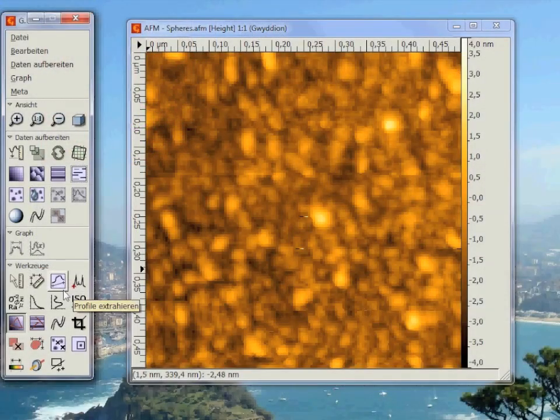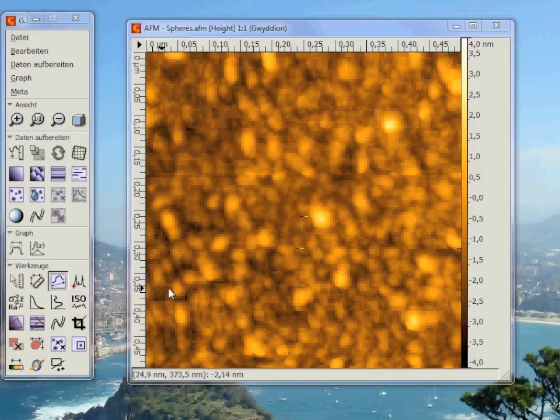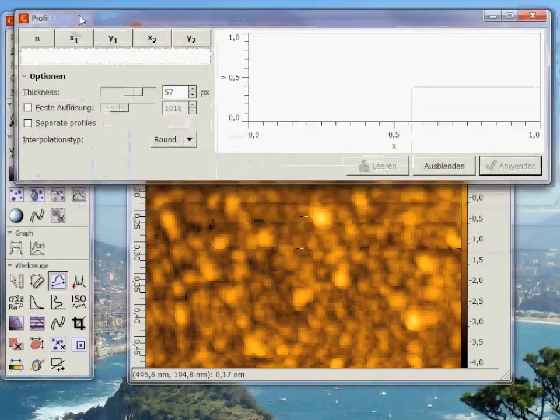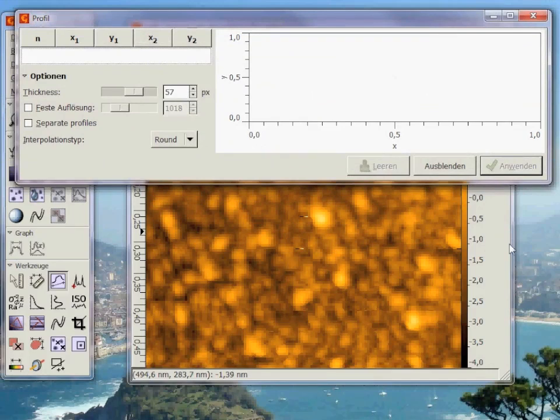The profile lines. For that you just click here. If you want to analyze the data you are interested in the exact profile of the surface.